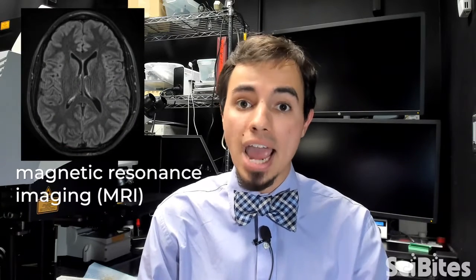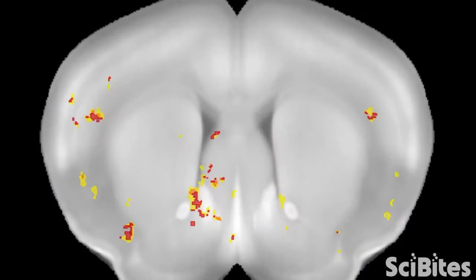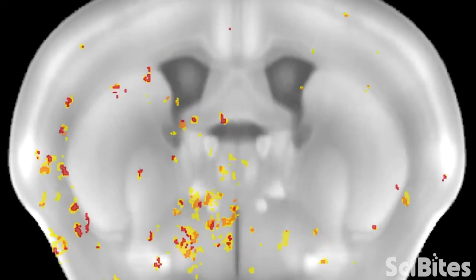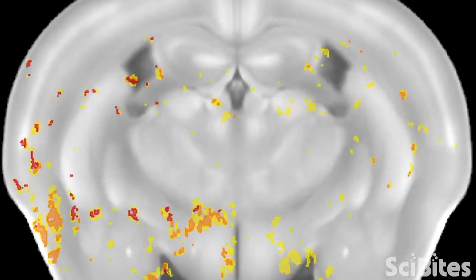In our lab, we're optimizing a technique that does exactly that, but for a mouse brain. Just like a magnetic resonance imaging machine, or MRI, can take a picture of a human brain, the tools we are optimizing create an image set from an entire mouse brain, which allows us to identify areas in the brain where the neurons were most active. But unlike a real MRI, this tool counts every single active neuron in the entire brain. In the end, we get a 3D heat map, kind of like the one you see here, where the red and orange colors mark the hotspots where the neurons were most active.